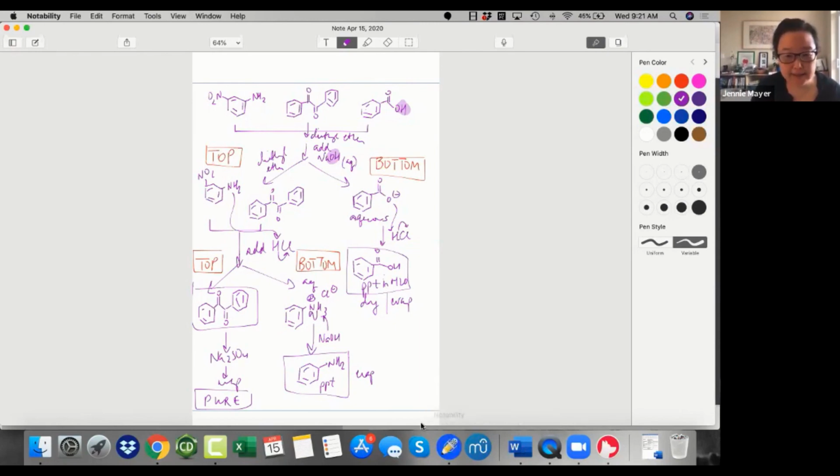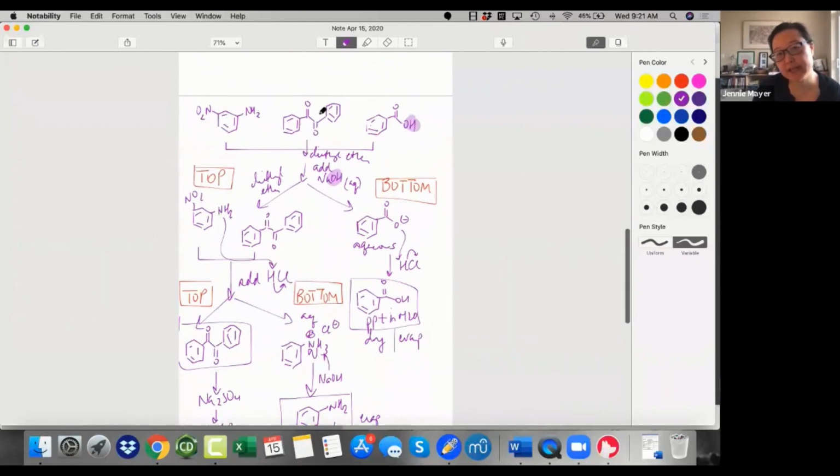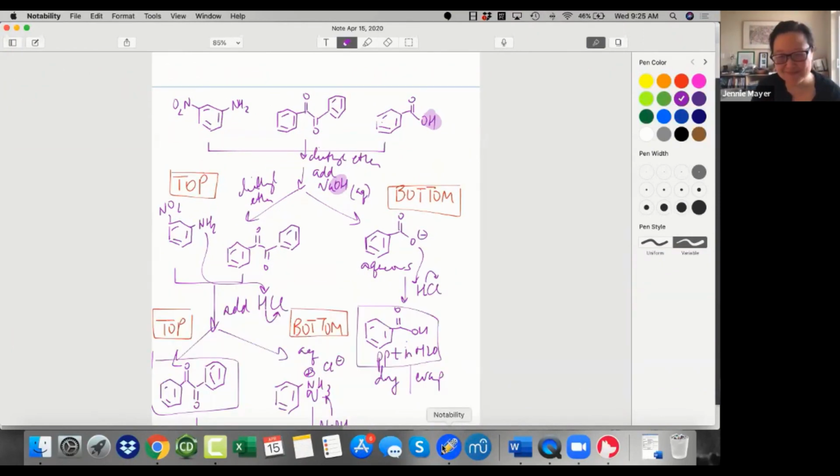All right, any other questions? That sounds like a lot, but the basic idea is just this. You're going to use a combination of, well, this is just extraction right here. But let's say for recrystallization, maybe you have 1 acid or base, so you do the extraction, and then maybe you have 2 nonpolar compounds, and maybe extraction won't work to separate those, so then you have to use recrystallization.